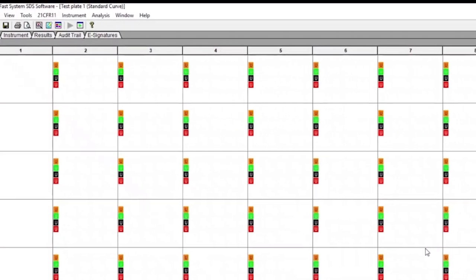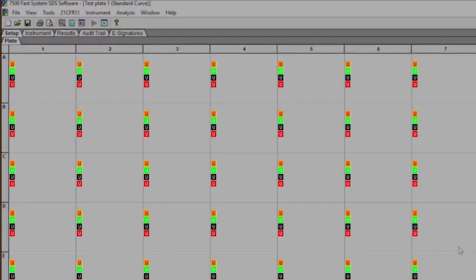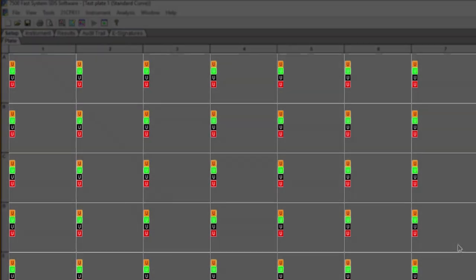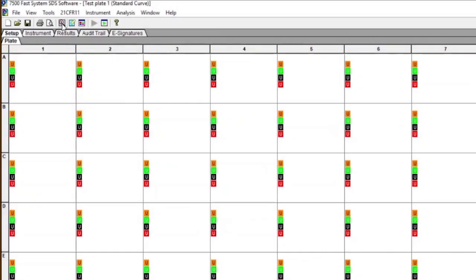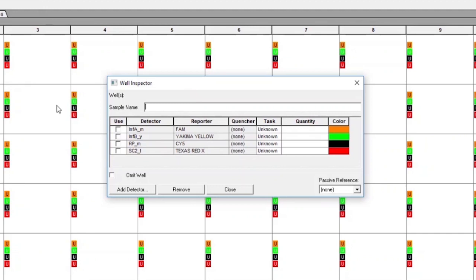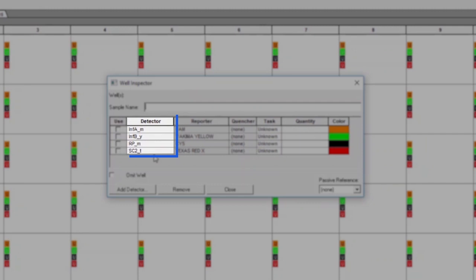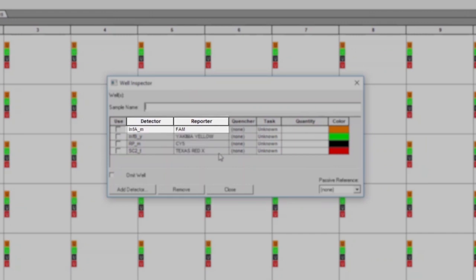After initialization, the Plate tab in the Setup window will appear. Each well of the plate should contain the four colored U icons corresponding to the four detectors of the FLU SC2 Multiplex Assay. To confirm the detectors that have been selected, click on the Well Inspector icon from the top menu. In the Well Inspector window, ensure that all four FLU SC2 Multiplex Assay detectors are included and that each has the appropriate reporter setting — for example, the INF_A detector reporter should be set to FAM — and each quencher is set to None.